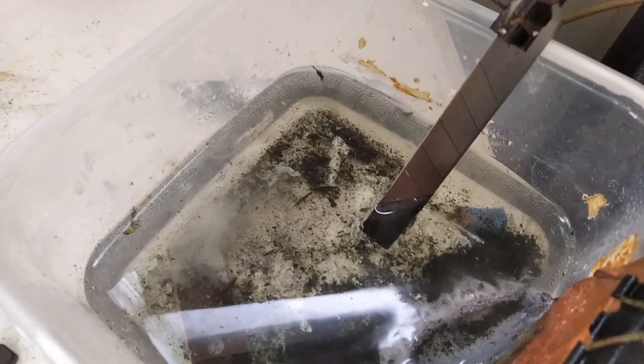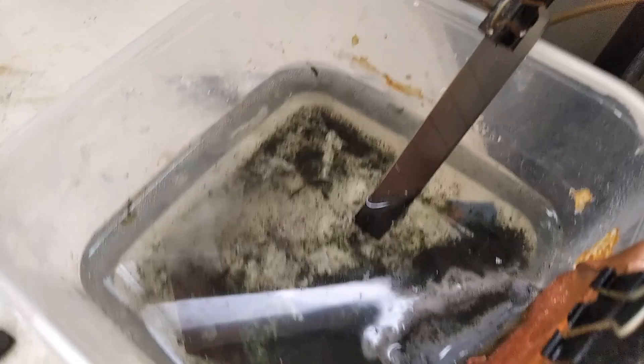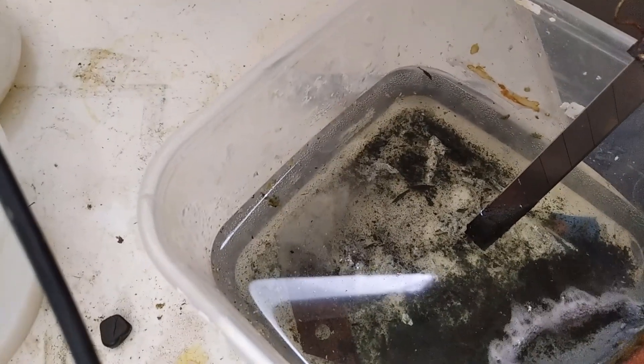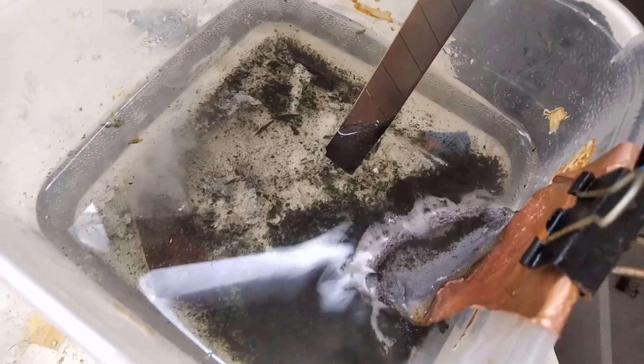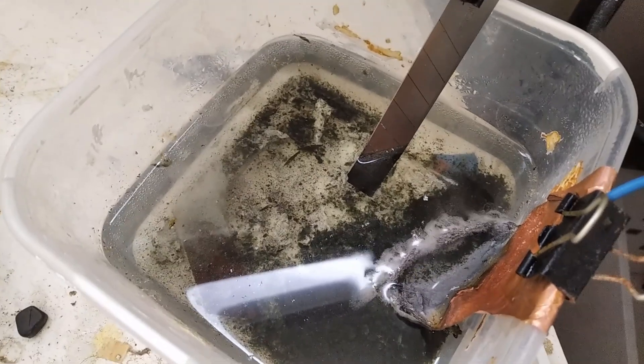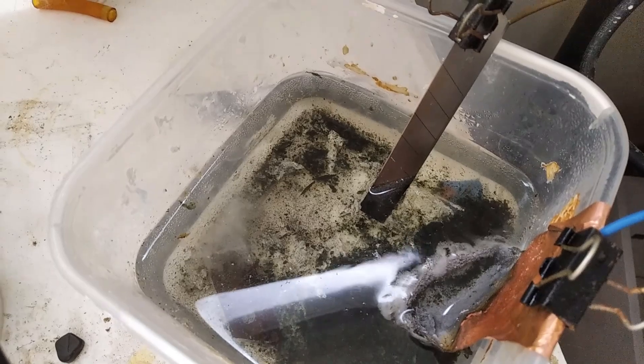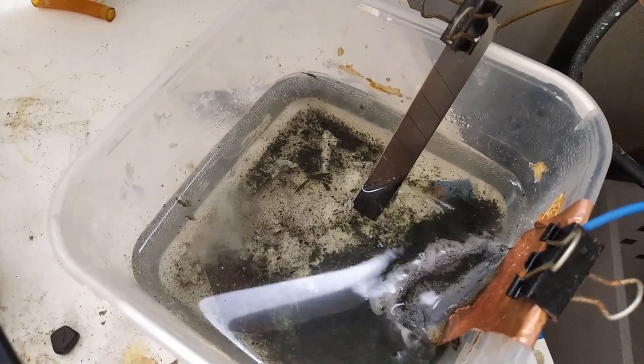Iron 3 sulfate is produced in this reaction due to direct oxidation at the anode. Iron 3 will not plate onto the cathode. To reduce iron 3 back into iron 2, you need a piece of iron in solution at the same time — this ensures any iron 3 ions react directly with it, forming back into iron 2, which then plates onto the cathode. That configuration is what makes this process work.